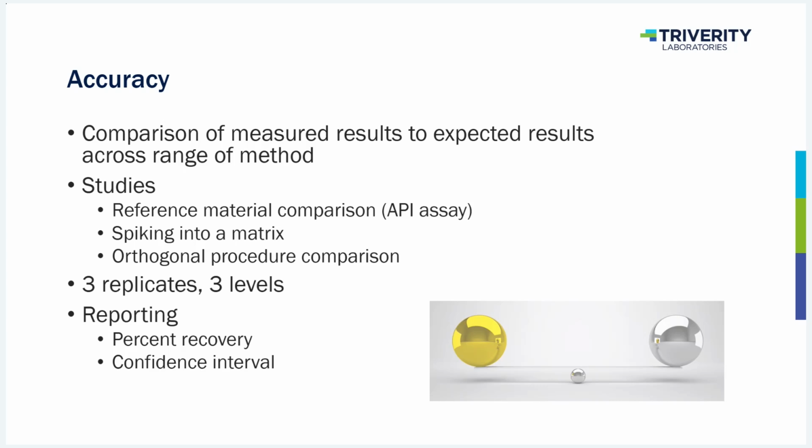So what we ended up doing there is, it was a soft gel. We had placebo soft gel that we cut open, and then we actually just weighed API onto it. So we were weighing 50, 100 milligrams onto the soft gels.